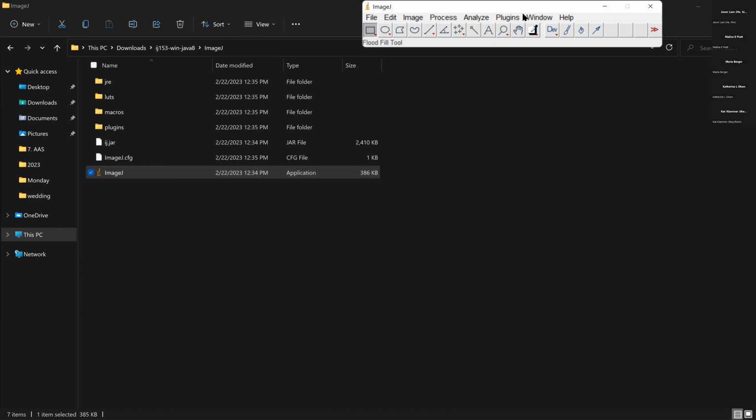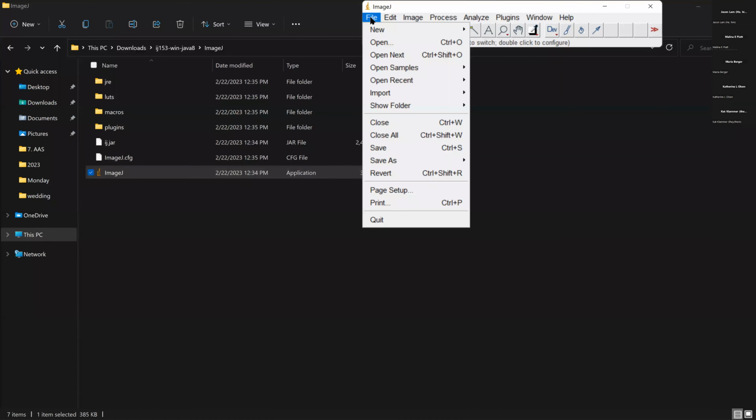Okay, so ImageJ is just this little toolbar here. And then the first step that you guys will be doing is bringing in your picture, the picture that we've given you, that example TLC plate. You have to open it in. If you're on the browser, you can go into your documents and then click and drag the picture into the area where it asks you to drop it.